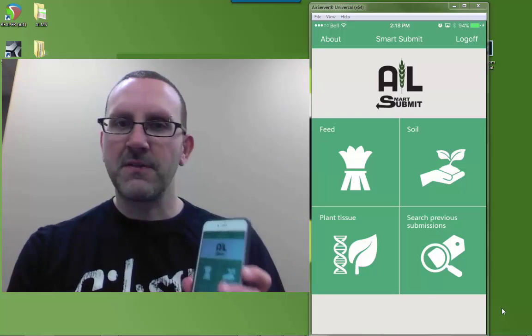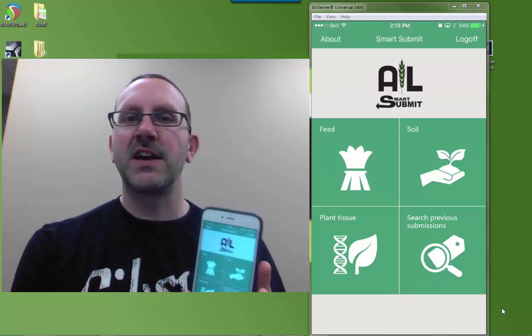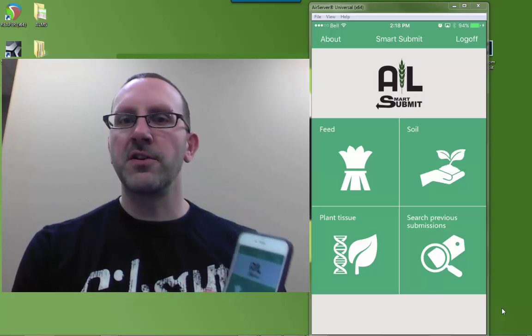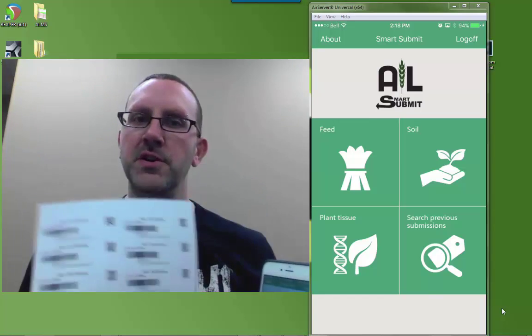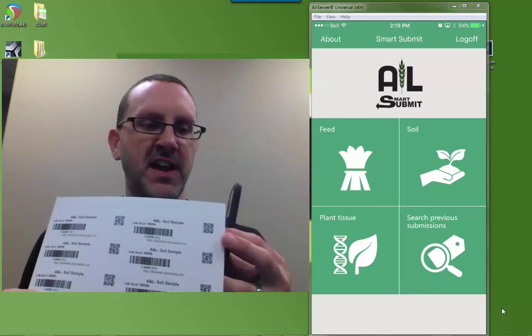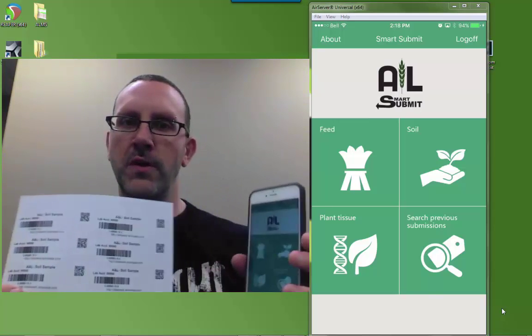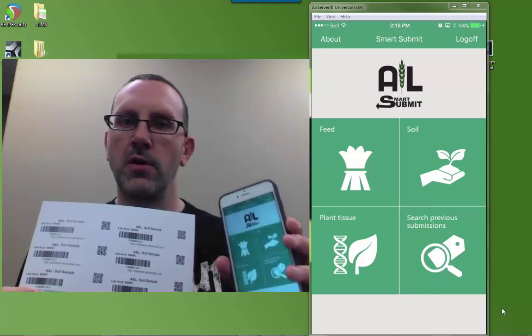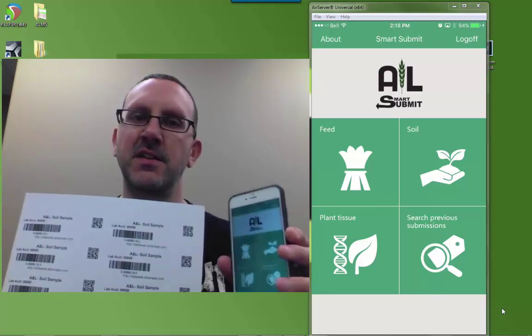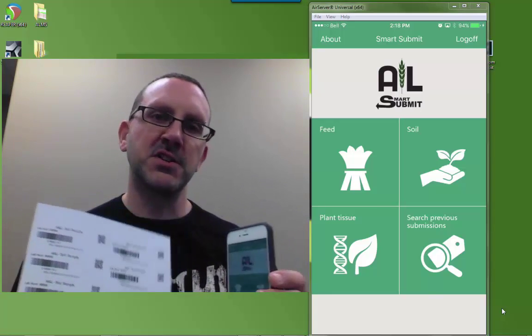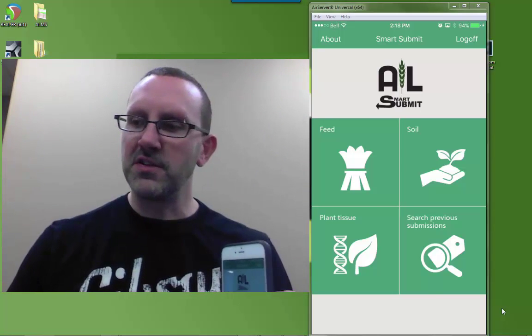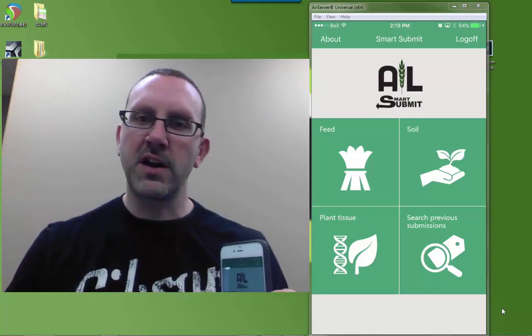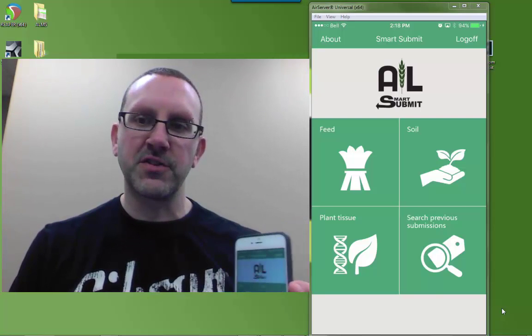The whole purpose of this app is for you to take samples out in the field using the labels that were printed from the DataWeb. You're able to scan this QR code with your phone or tablet and it submits all the sample information to us electronically. So it saves on paperwork and increases our accuracy of the submission.